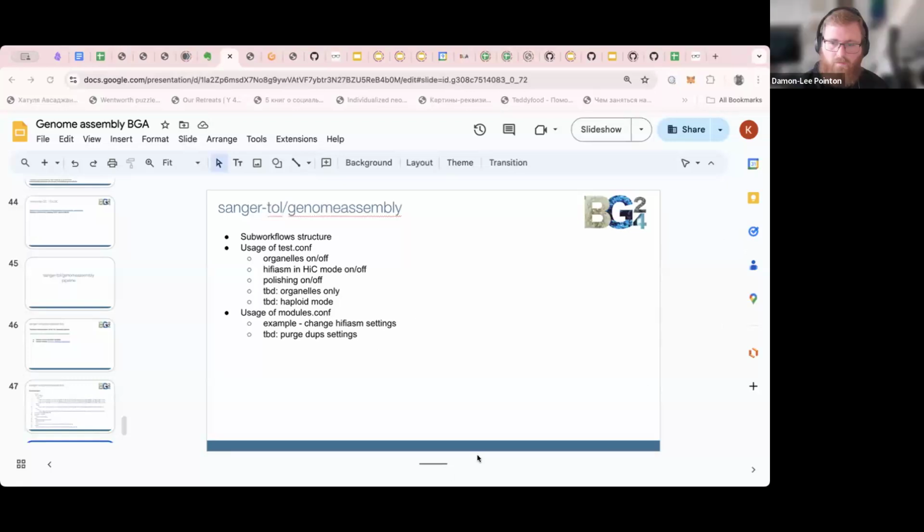We have one in the Discord at the minute. From Capture: Hi, Ksenia. I just looked at the ToLQC page for another species where OTK was used for organelle assembly. Strangely, there are reference sequences given for the assembly, even though OTK should work de novo. So what was the given reference used for?